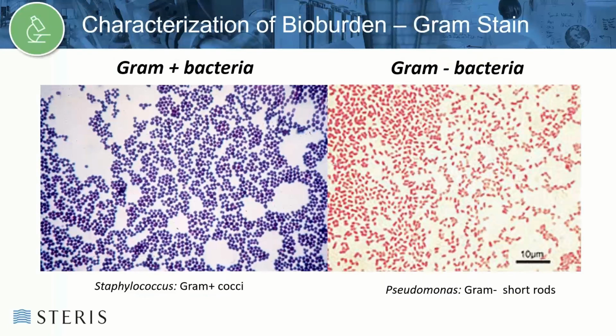Gram staining of the colony gives us further clues to the organism identification. The gram stain tells us about the cell wall of the bacteria recovered. When viewed under a microscope, gram-positive microorganisms appear purple from the primary stain in the staining process due to a thick peptidoglycan layer.